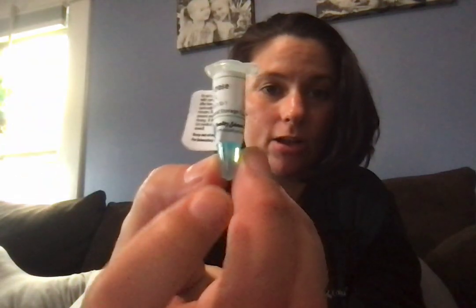Now, sucrose tested negative. It didn't change color at all. It stayed the blue color of the Benedict's reagent. And this means that there's a lack of aldehydes present, or there's no aldehydes present. And it also means that sucrose is a non-reducing sugar or carbohydrate. That means that it won't undergo oxidation.